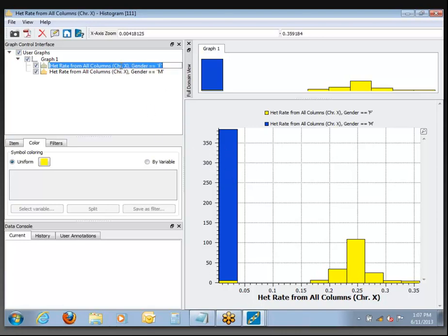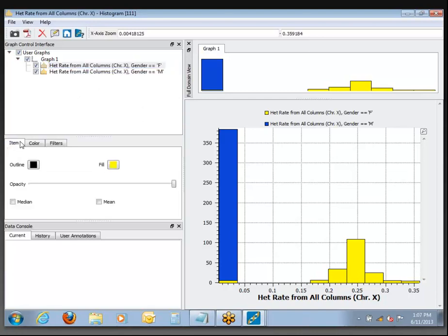If you take the item for females and click on it once, then switch back to the Item tab, now you can adjust the opacity and make that yellow more see-through. What we can see is there's a yellow group here that were originally labeled as female but are consistent with males. And over here a blue group showing through behind the yellow — samples that are consistent with female but originally labeled as male.